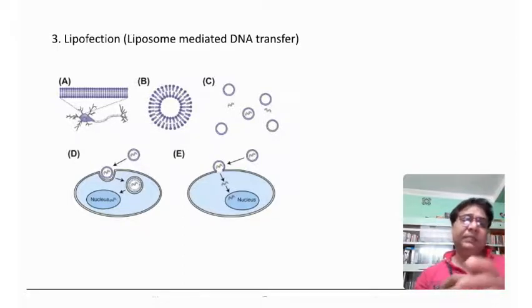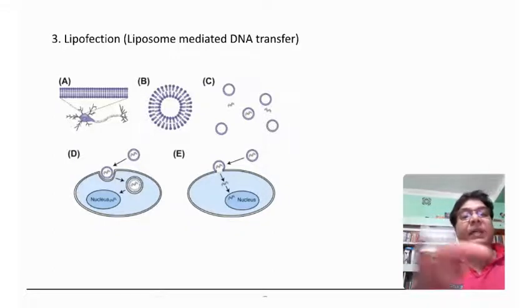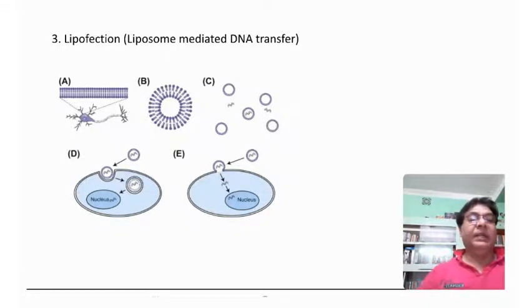There is yet another mechanism by which liposomes are internalized, shown on the left side of the picture. The whole liposome gets internalized by an endosomal mechanism, and then the inner liposomal phospholipids get dissolved and the DNA is expelled into the cytosol and taken in by the nucleus. Transformation in a eukaryotic cell is called transfection. So transfection using liposomes is called lipofection.